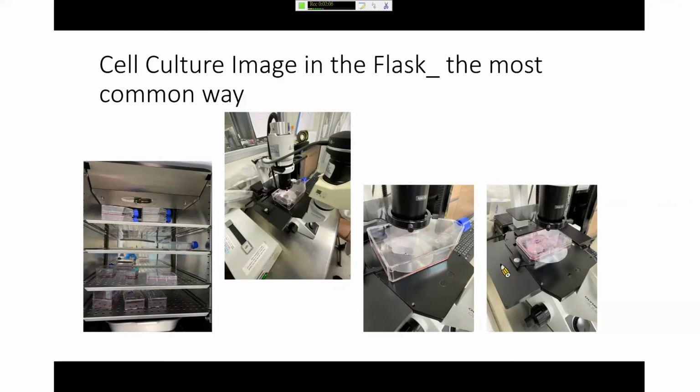Of course, with this process, you can only record the imaging at some specific time point, for example, 20 hours or 24 hours. And this kind of result will lose some continuous or specific cell response during this time period.